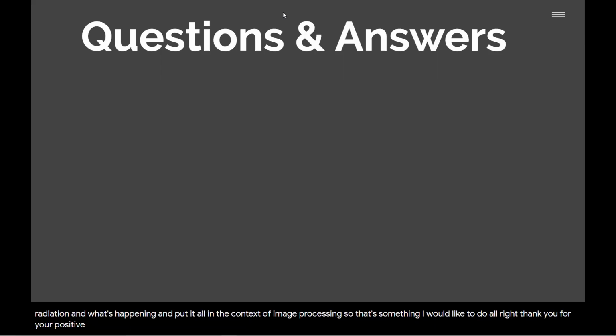Here's a question. Sydney asks, what about Hough transforms? Do you have anything prepared for that? No, we don't. That's a great question, and that's absolutely something that has to be covered in an image processing course. It's just something we've never put in Dragonfly.